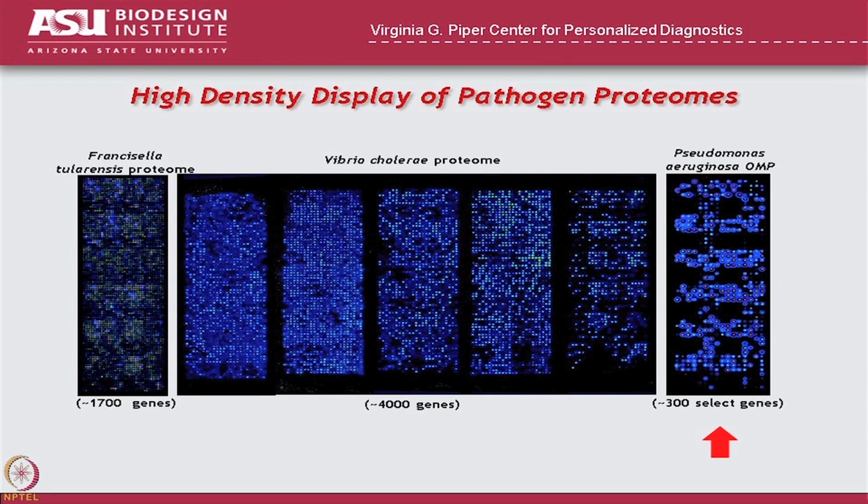This is pathogen proteins, right? And what you're looking at here, I remember I mentioned tularemia when you asked your question. That is the entire proteome of Francisella tularensis. In fact, it's the entire proteome in duplicate. So we got them all onto a single array, because in the end, we got that to work. These 5 chips are cholera, so Vibrio cholera.